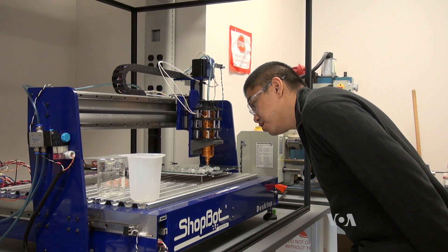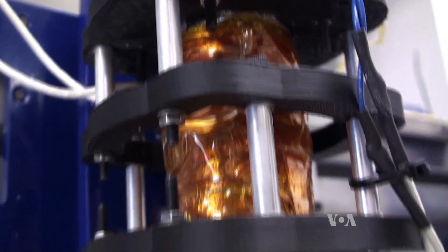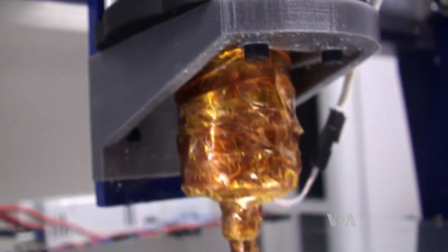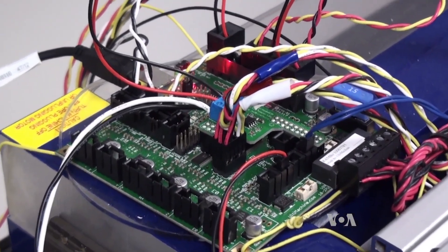All of this research is made possible by this specially produced fast and accurate 3D printer, which Jordan Miller says is a device designed for cutting metal that has been adapted for this experiment. We can use the same firmware that everyone's using for 3D printing, but instead we're extruding sugar with it instead of cutting metal.